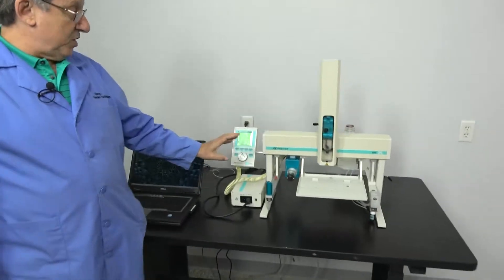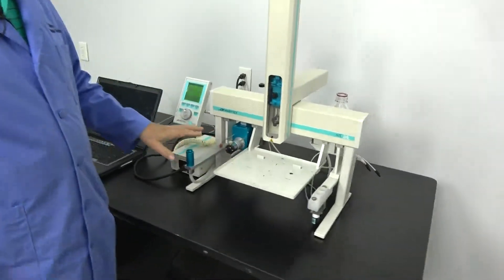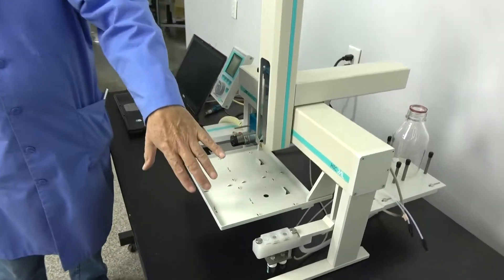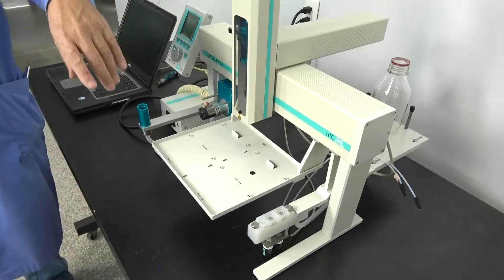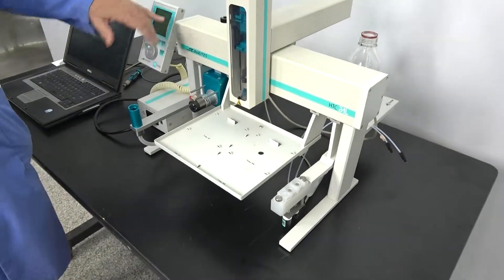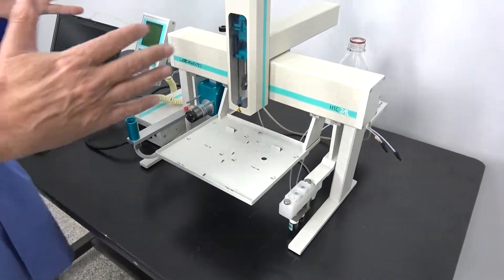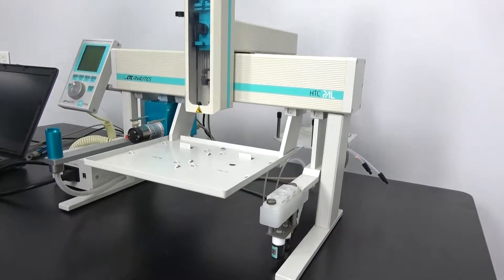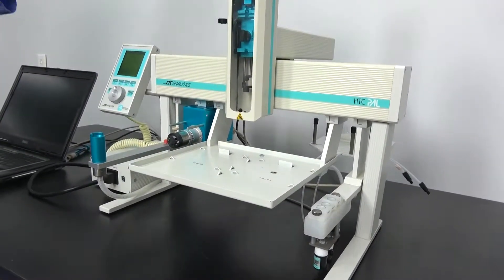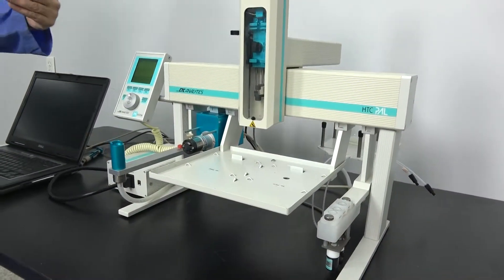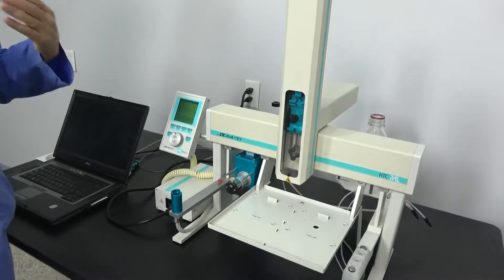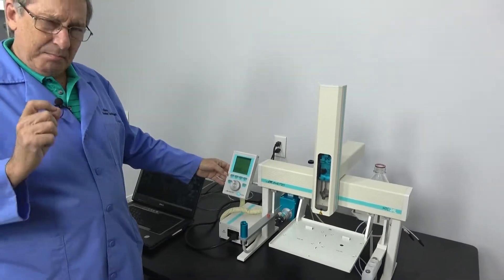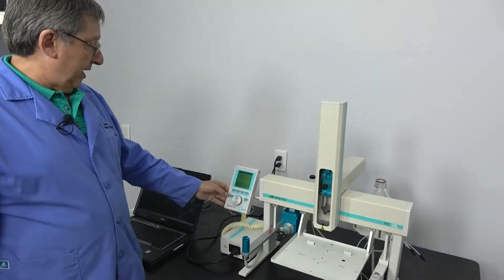When I was talking about location, these can be configured not just with two valves or two washers or a stack cooler, but also they can be placed anywhere along this, within this frame. You need to teach it where each one of those is, and you need to periodically update those locations, because the machinery is going to get a little bit out, sometimes out of slight minor adjustments. Very easy to do.